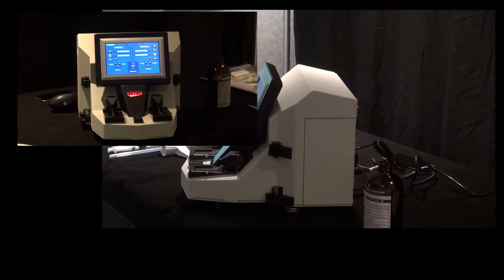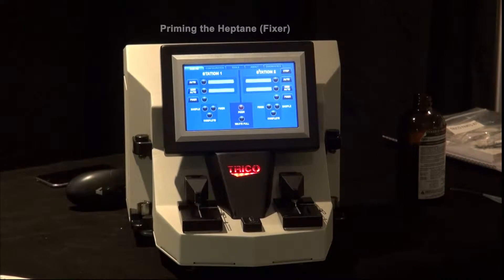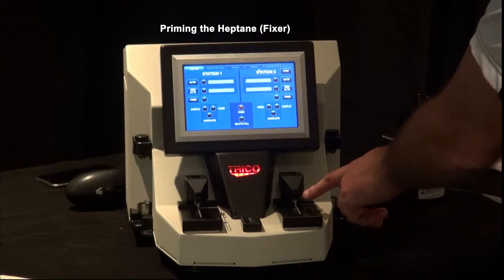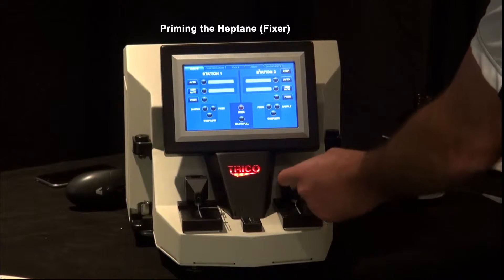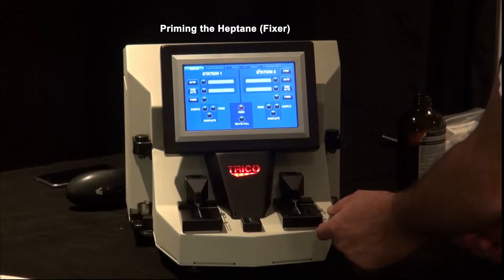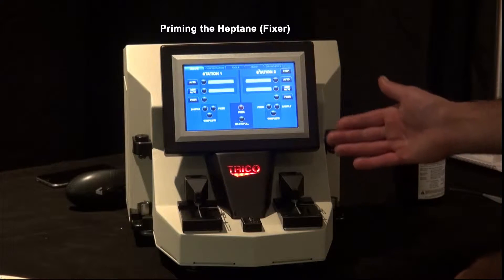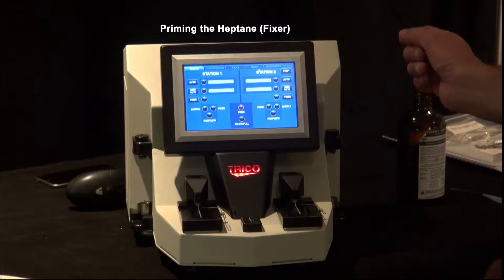In this section, we're going to prime the unit with the fixer heptane. There is a procedure to go through if the lines are dry or if the unit has been sitting a long time — the lines will dry up from the tips all the way back. There are three feet of fixer line inside the unit, and it takes a long time to prime the system because the pumps dispense at such a minute rate.